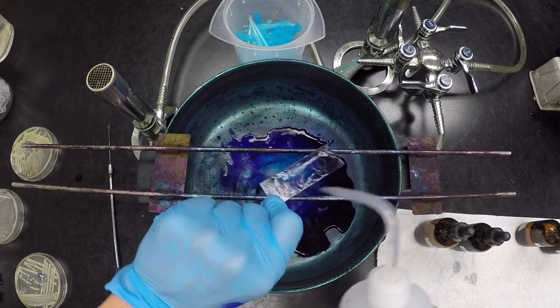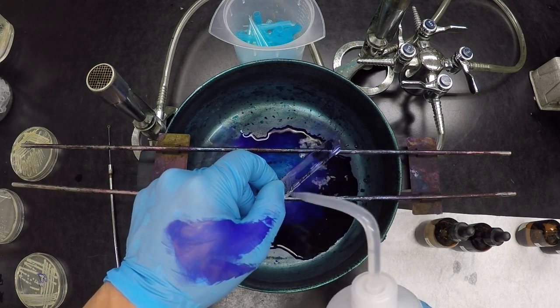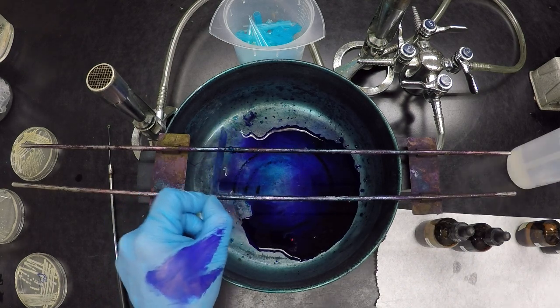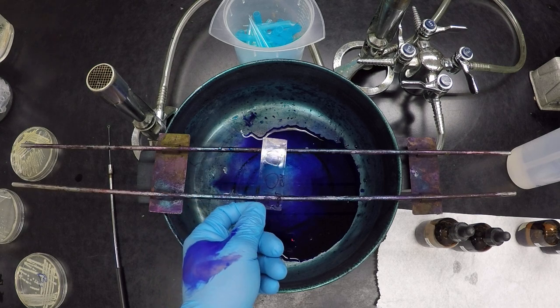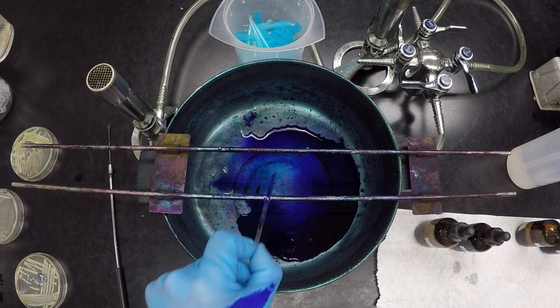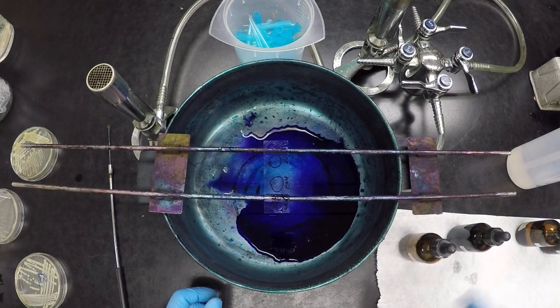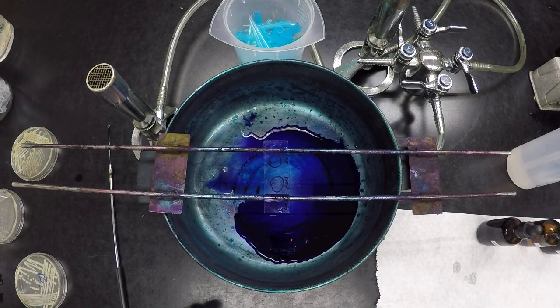And now at this stage, the Gram's iodine will have reacted, and our crystal violet should have stuck nicely on our gram-positive cells, but on our gram-negative cells, it's still binding kind of weak. So again, tap off the excess water and add the alcohol. Now the alcohol is what we call the differentiating step. This is the part that's going to remove the primary stain from our negatives, but not from our positive cells. This is the most important step of any differential stain. This is the step that can cause the most problems, right?